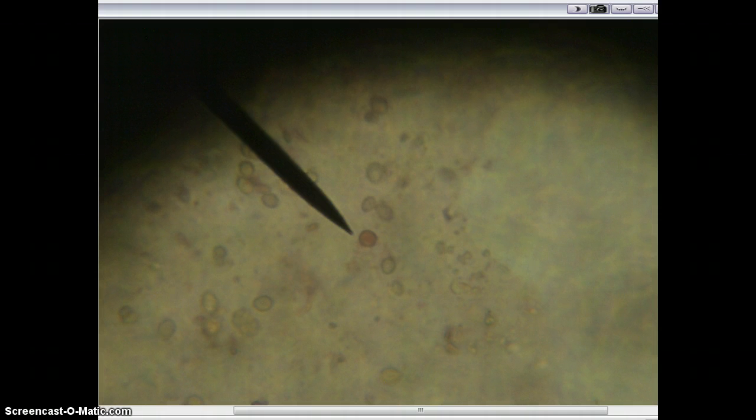And as you can see, especially that one yeast cell there is really pinkish-reddish inside. It is living, it is taking in the liquids with the sugar, and in doing so, taking in the dye color.